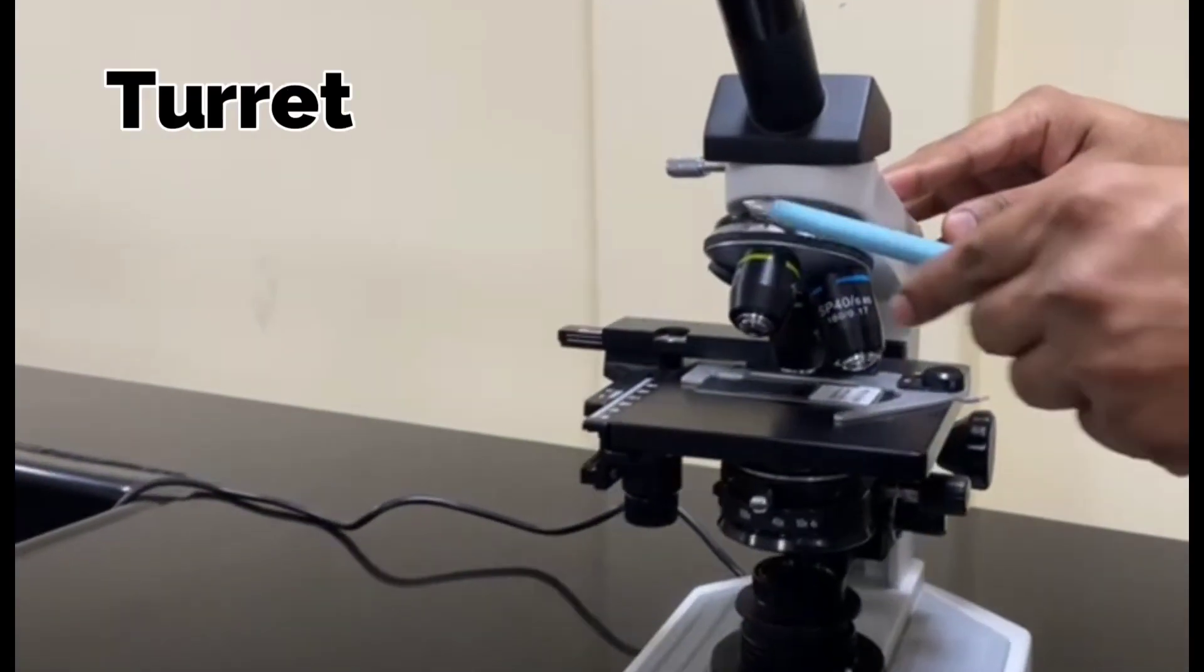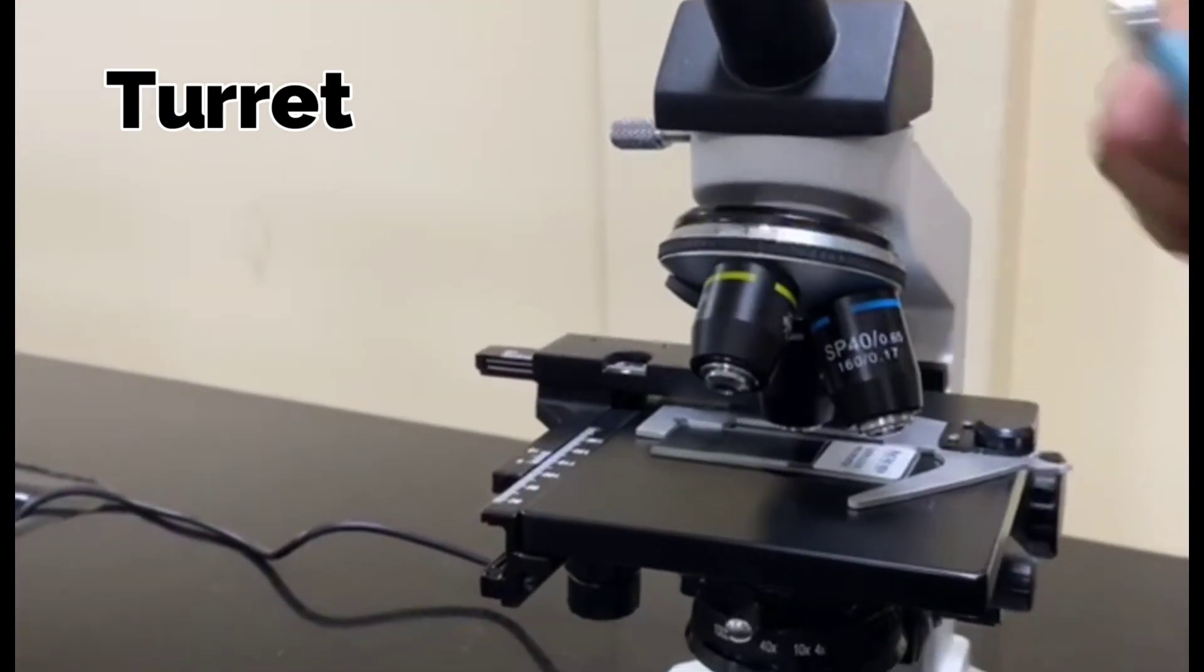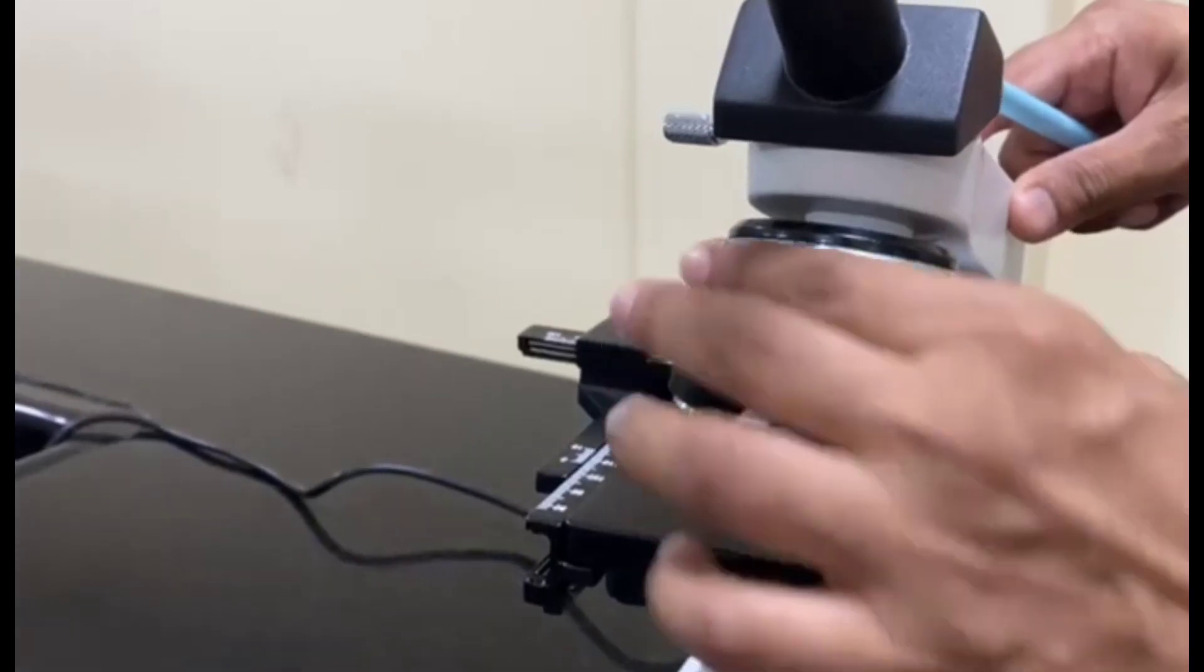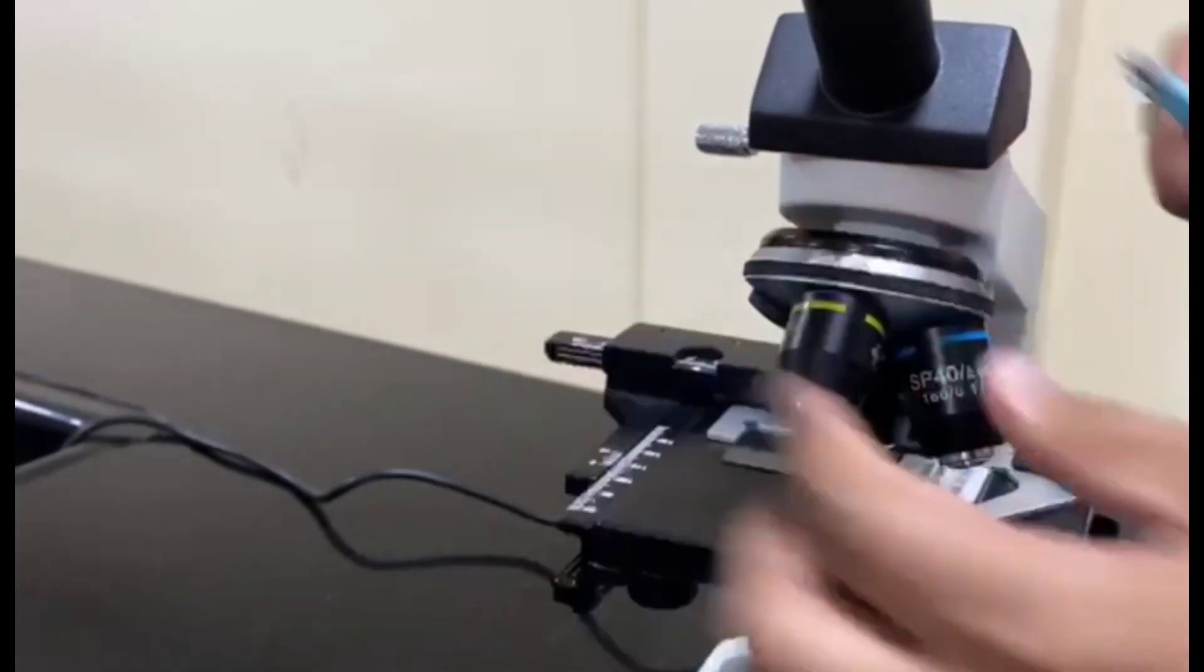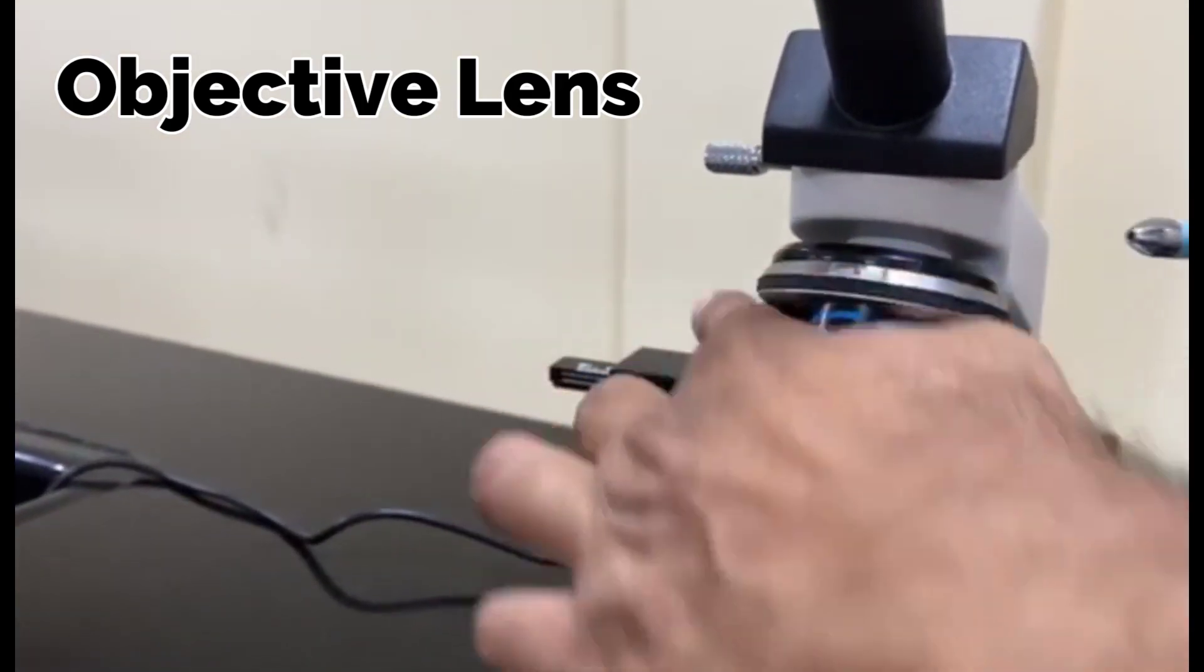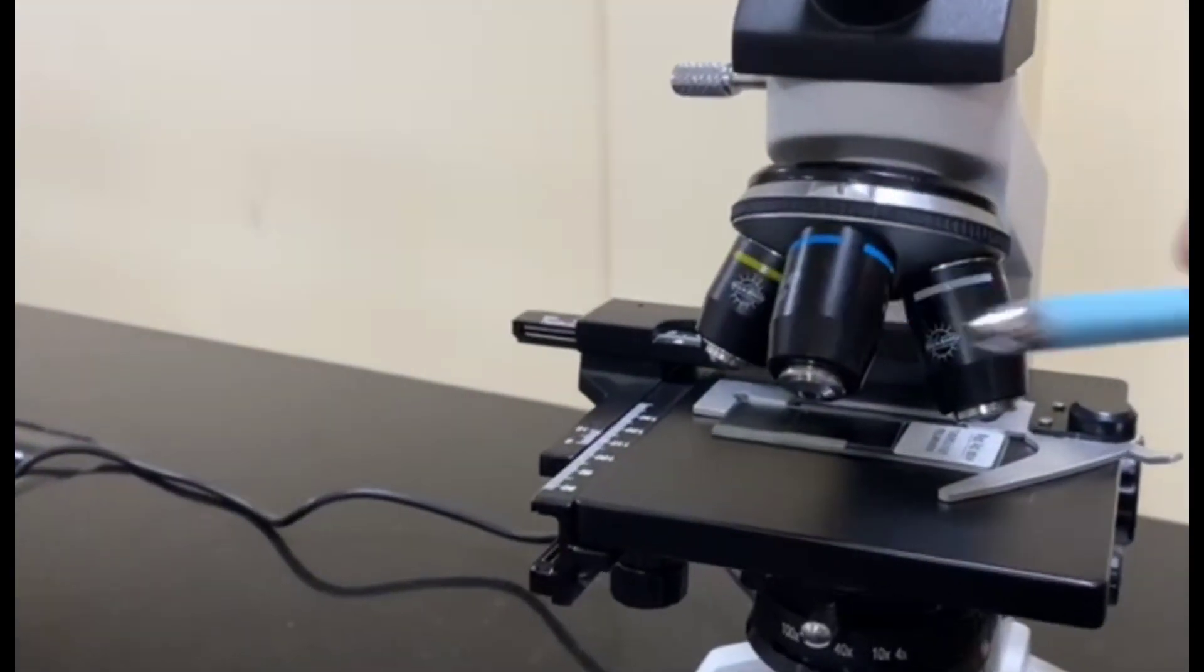Come to this part of the microscope. This is a turret where you can see different objective lenses are attached, and you can revolve this turret to position the different magnification power of objective lens.